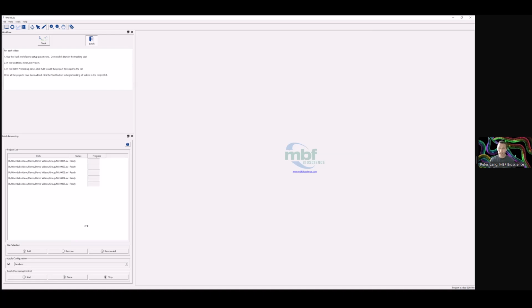Actually, at one of the international worm meetings, where we met with some customers, they said, we understand why it works with project files, but we'd like it to work like this. So we're always looking for that feedback from you, how we can make WormLab more usable for the worm community. And this is just another example of that.